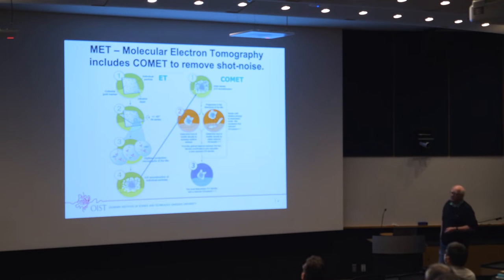I mean, you know how it is to go in a room like this. If we lower the light here more and more and more finely, you will just see gray things in here. You won't see color, and it will look grainy. Huh? That grainy stuff is what you have in here along with your reconstruction. However, you can add a step, and that's what we have done.